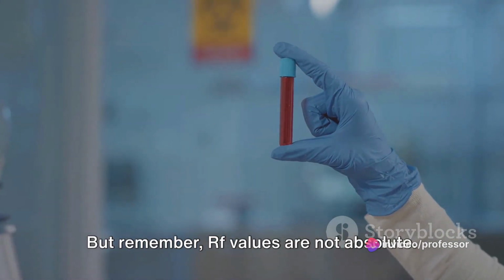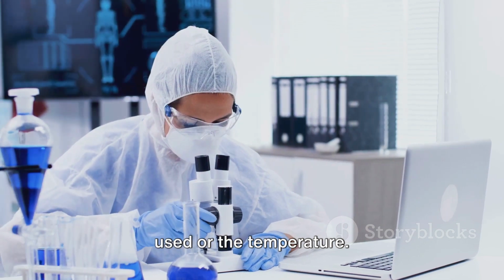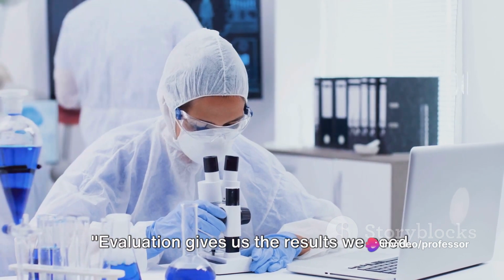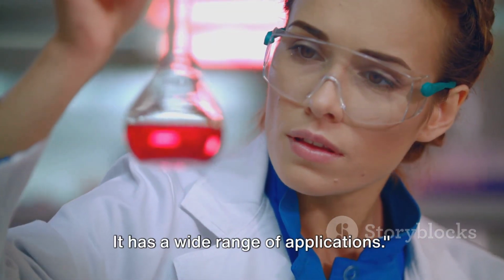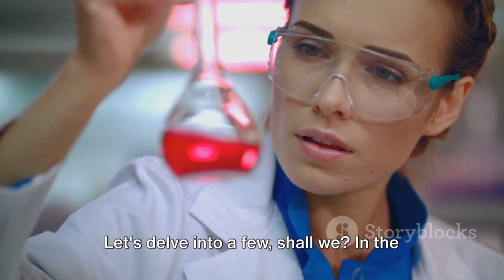But remember, RF values are not absolute. They can vary depending on the solvent used or the temperature. So always compare your results with a reference or under controlled conditions. Evaluation gives us the results we need. But where do we use TLC? TLC is not just a lab technique, it has a wide range of applications. Let's delve into a few, shall we?